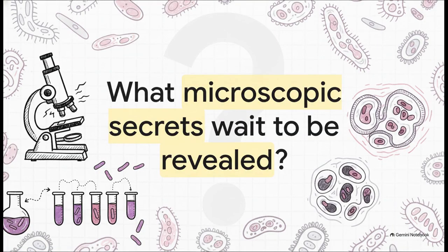It's truly an incredible process, isn't it? From the basic bright field microscope to the unforgiving chemical gauntlet of the Gram stain, right through to the highly specialized techniques meant to break down waxy armor.